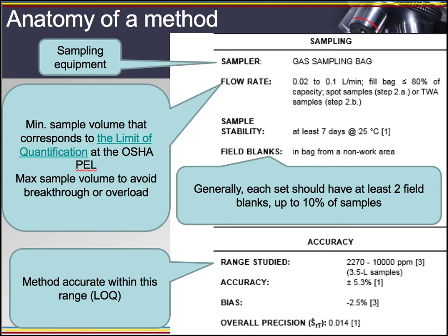And I'll give you some tips on how to determine what is the best flow rate. Some methods, for example for silica, only have one flow rate. So let's take a look at that example now.